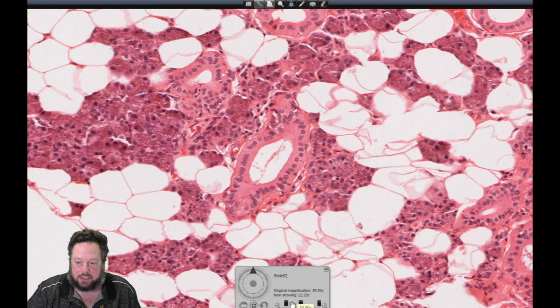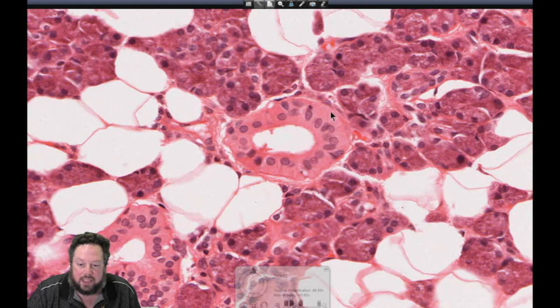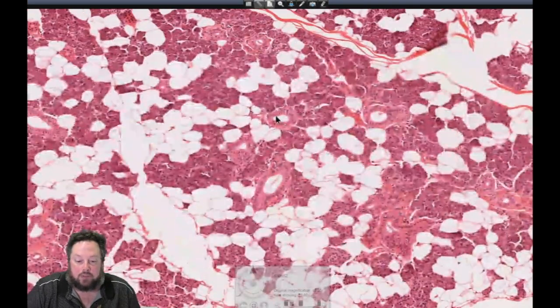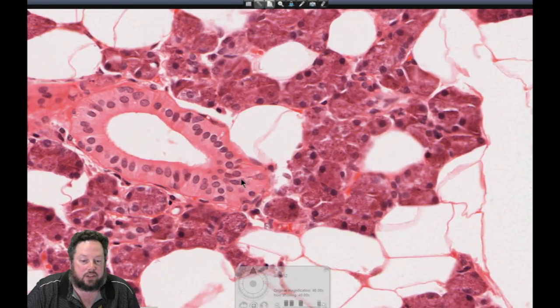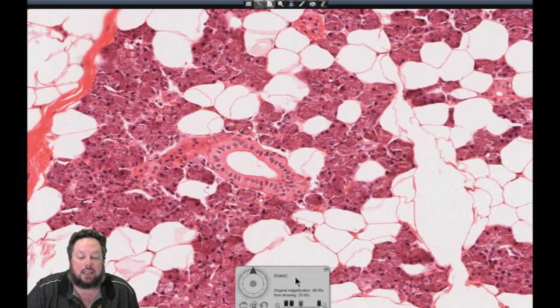Now, it's not always completely visible, those striations, but generally any of these larger ducts, which you can see amongst the serous acini, are going to be the striated ducts. So you can kind of make out some of these striations down the bottom here. I don't know how well that's translating onto the stream there. So parotid salivary glands, entirely serous, have striated ducts. They're quite clearly visible amongst the acini here. Again, another striated duct here. Very pale, quite tall cells amongst the more basophilic staining serous acini.